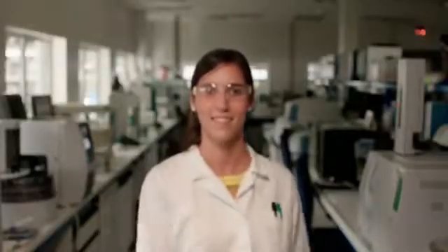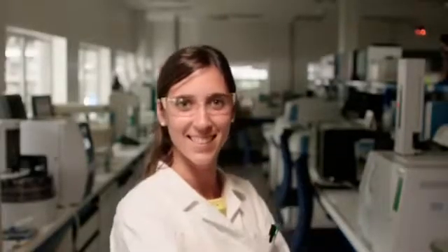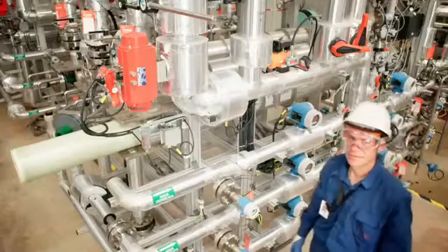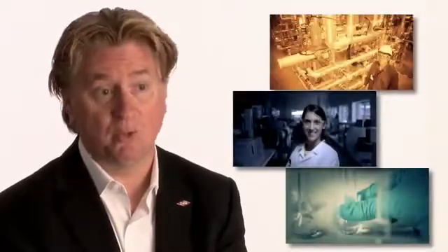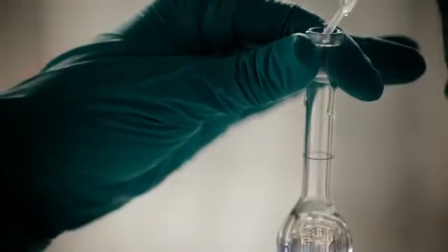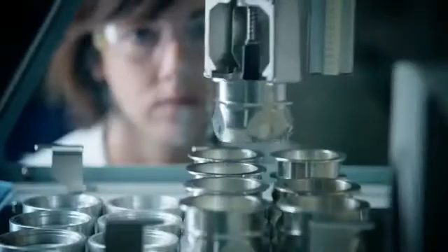The operations team and analytical team are very key to our innovations in Dow Water and Process Solutions. Not only do the operators run the experiments, which are very complex because we're dealing with various types of waters, also the analytical labs are there to analyse the waters and the results of these experiments. And it's really the collaboration between those two groups that brings together our innovation.